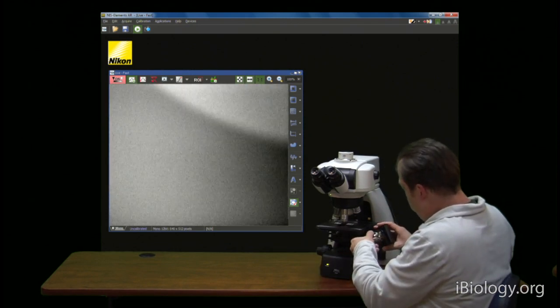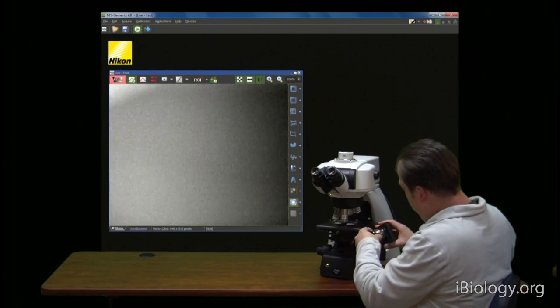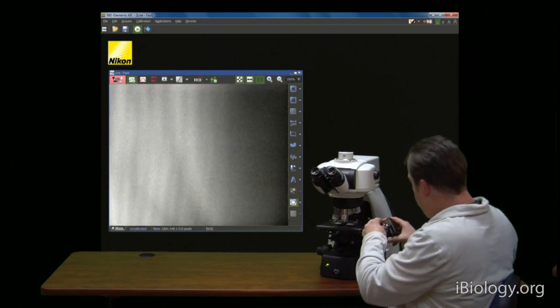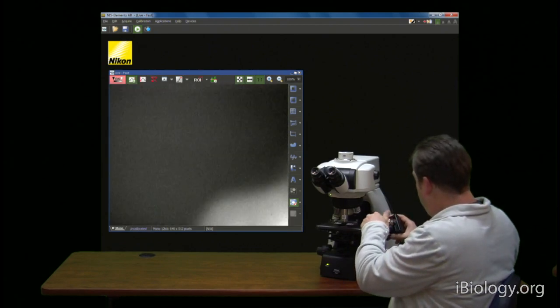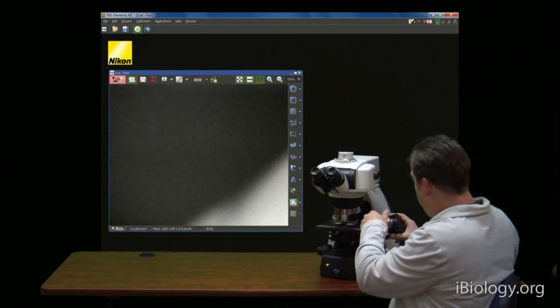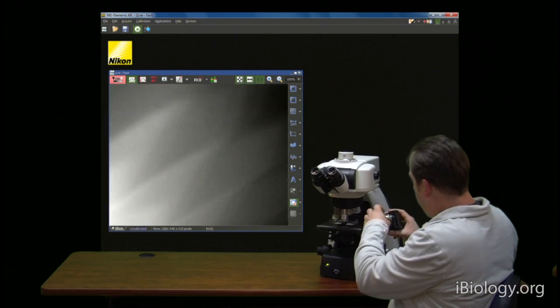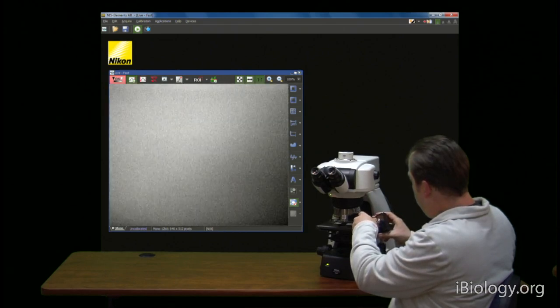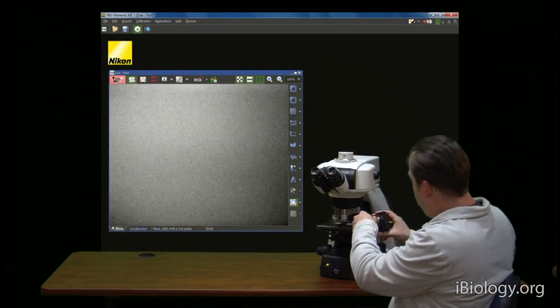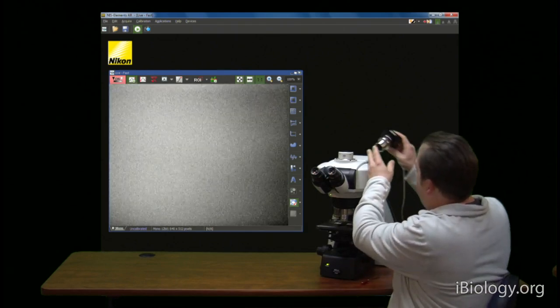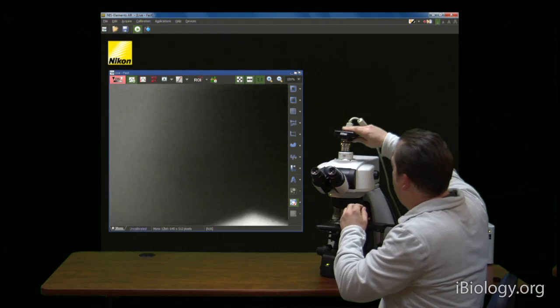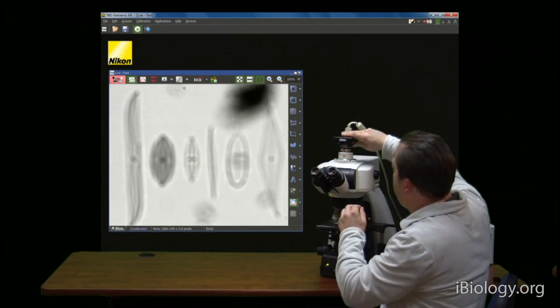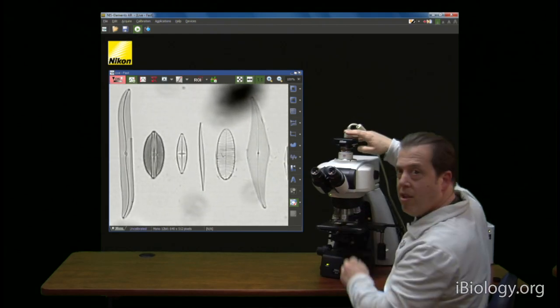Let's put that back on the microscope. And now let's take a look.